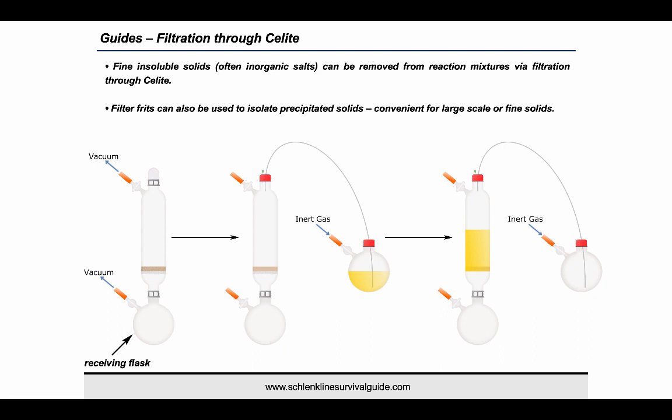Caution is required when backfilling with inert gas to ensure that the Celite layer is not disturbed. The reaction mixture can then be transferred into the filter stick by cannula transfer and a partial static vacuum can be applied to the receiving flask to initiate the filtration. The solids and Celite can be washed and extracted with an appropriate solvent, and then the filter stick can be replaced with a greased glass stopper to enable further manipulations with the solid-free filtrate. Filter sticks are also a convenient way to isolate fine solids. In these cases the Celite is omitted, and once the filtration and washing steps are complete, the solid can be dried directly on the frit under vacuum prior to isolation in the glove box.